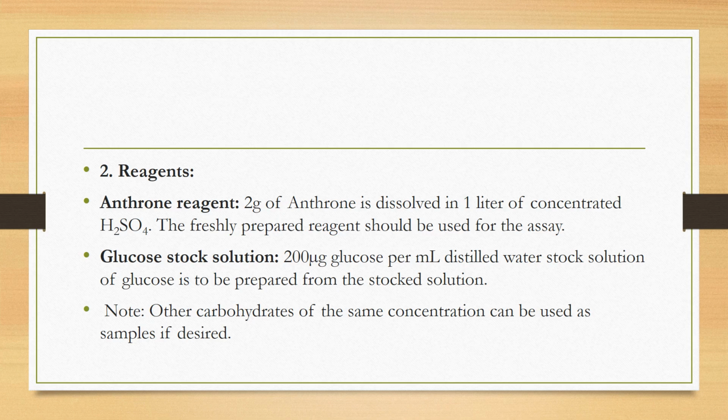Okay, then we have the glucose stock solution, 200 microgram glucose per ml of distilled water. Dissolve this 200 microgram of glucose in 1 ml of distilled water. The standard solutions of glucose are to be prepared from the stock solution.